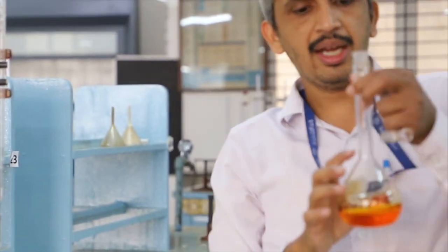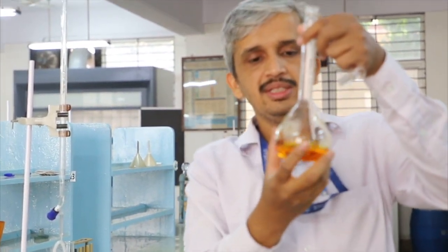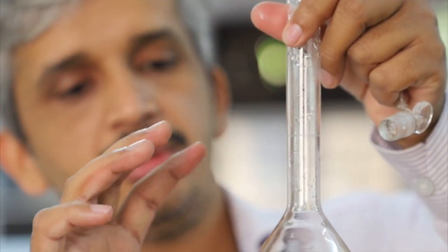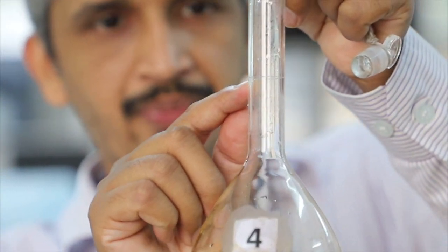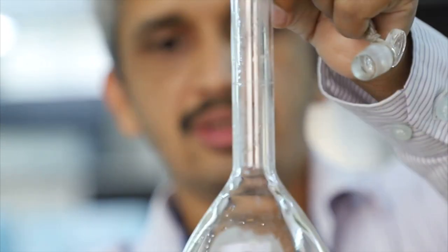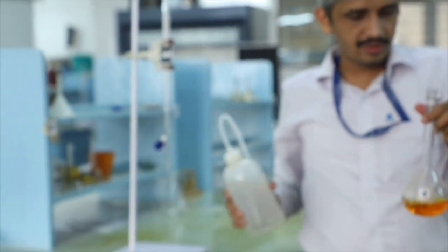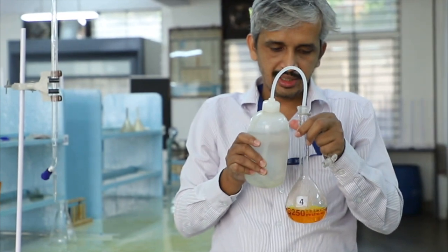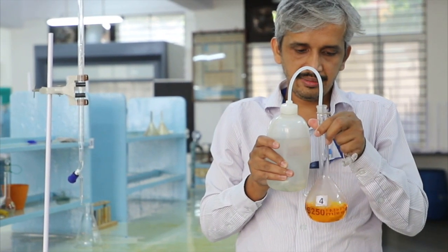It's completely dissolved. Now I have to add water up to this mark. This is a 250 ml standard flask. The total volume is 250 ml if you fill up to this mark. The solution should be filled up to this mark. Now we have added only a little bit of water, so the rest can be filled now. Once after dissolution of the solute, the rest of the water can be filled slowly and carefully.